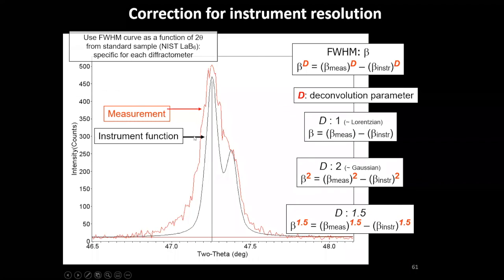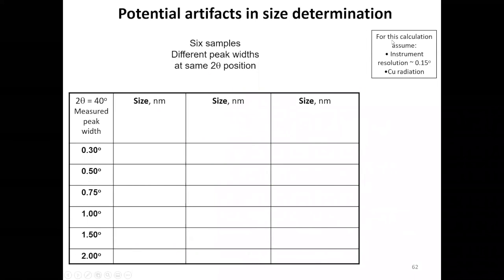Look at the correction. This is just a direct subtraction. This is a square root of the squares, Gaussian. And this guy here, Johnny, is more sophisticated. He's doing like a mix of that. And look at how much difference in terms of grain size they obtain.